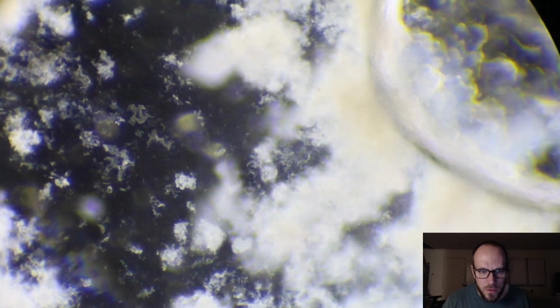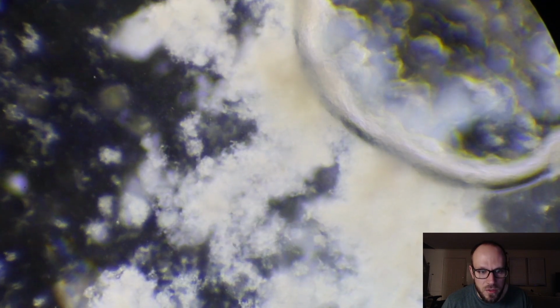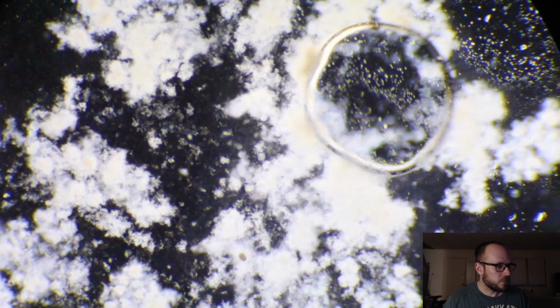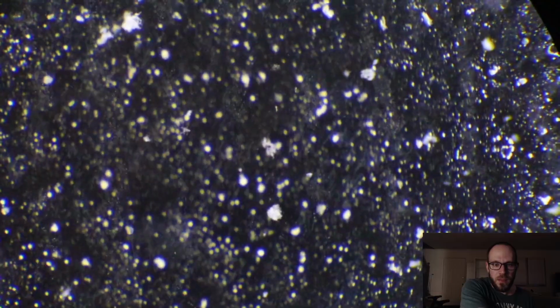With dark field, decreasing the aperture on the light tends to be completely useless just using your own eye to look through it. But yeah, there's nothing interesting here. Well, I mean, it does show that there were thousands of little guys just swimming through this.